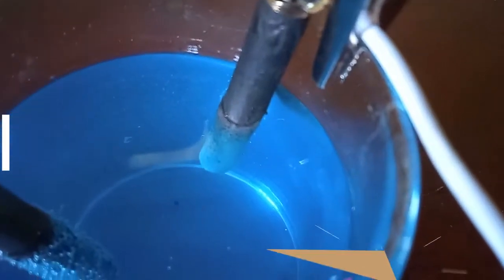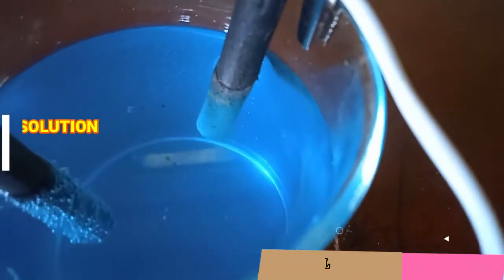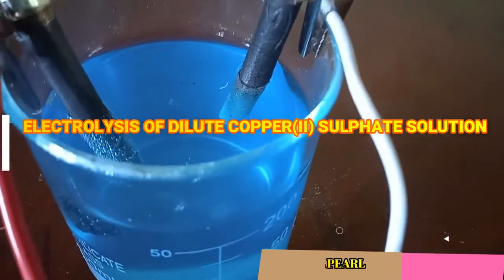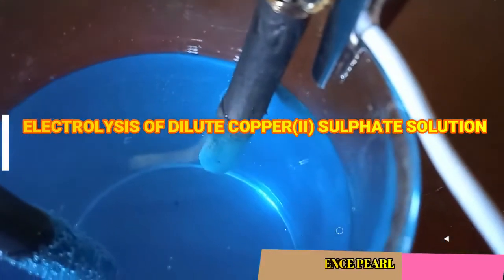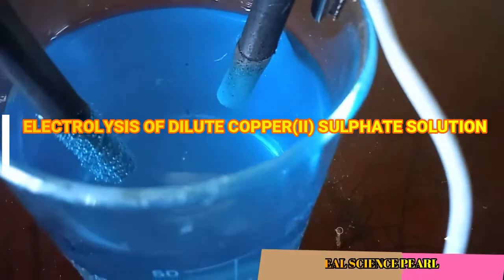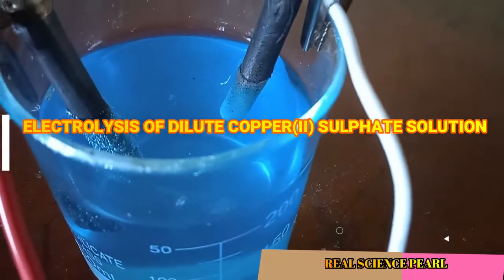Hello guys, you're most welcome to Electrolysis, and today we are going to look at electrolysis of dilute copper sulphate, and we are going to understand what I was supposed to consider and how I can do this at home.